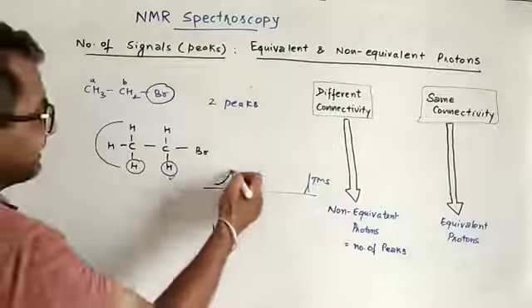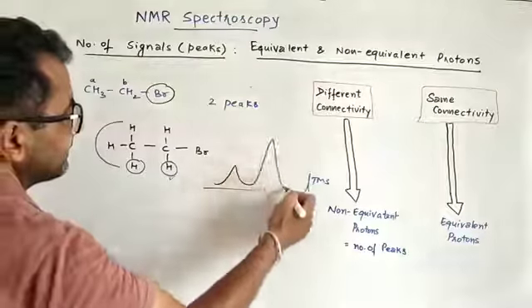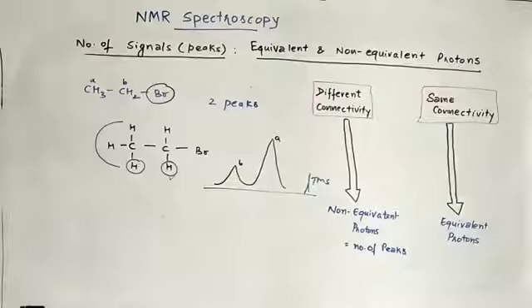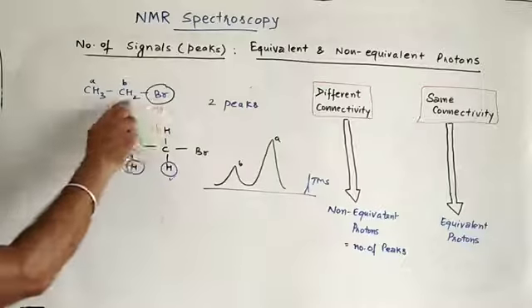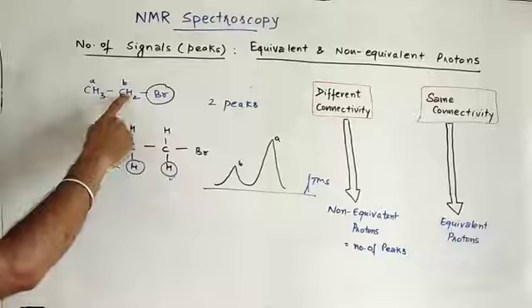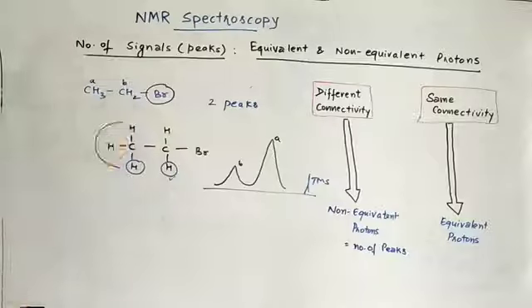So B will be on this side. So this is your B, this is your A. So you can think about the position in the NMR spectra also. Why is B toward down, de-shielded? Because here the bromine is directly attached, it decreases the electron density. Here the electron density will be less. So these 2 protons come in resonance at lower field. Lower field is the left side.